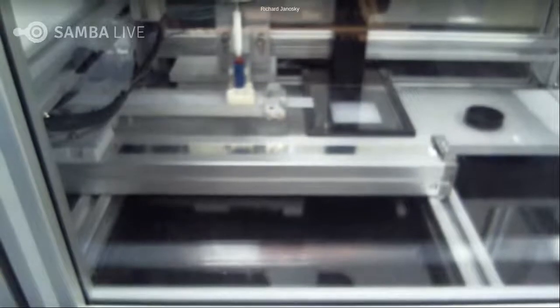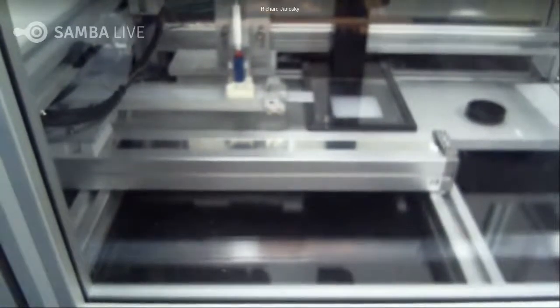So we can see our sample in here prepared. When we talked earlier, we talked about the different extrusion profiles. We wanted to get the camera close enough, and you can see this when we go to run the extrusion profile, you'll see the different speeds. So shortly, it's ready to test.